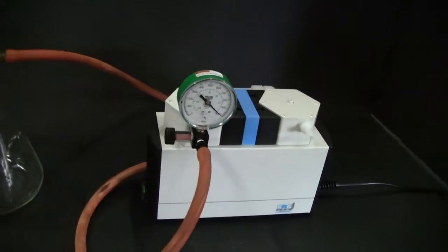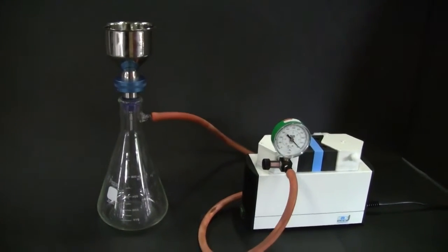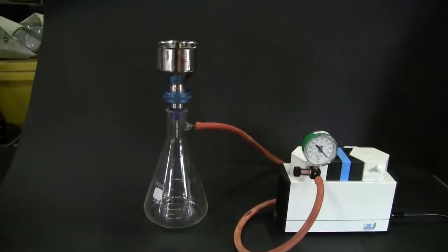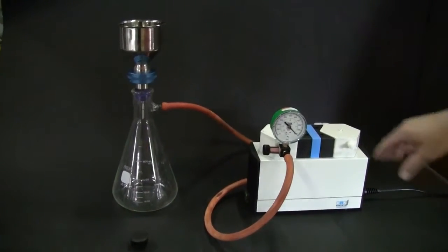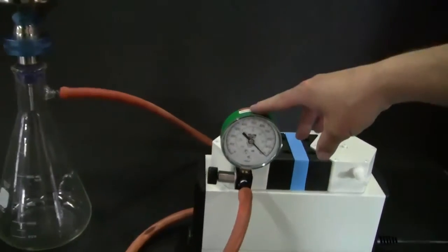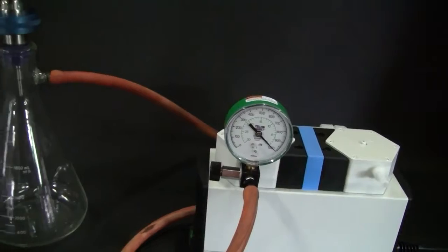This is a dual diaphragm oil-less vacuum pump. It's fantastic for laboratory applications. What we've combined with it through KNF is a gauge package, a readout in millibars, and a needle valve to adjust the vacuum.